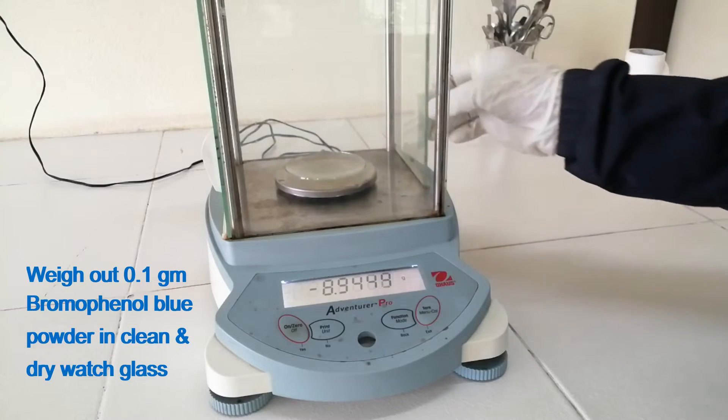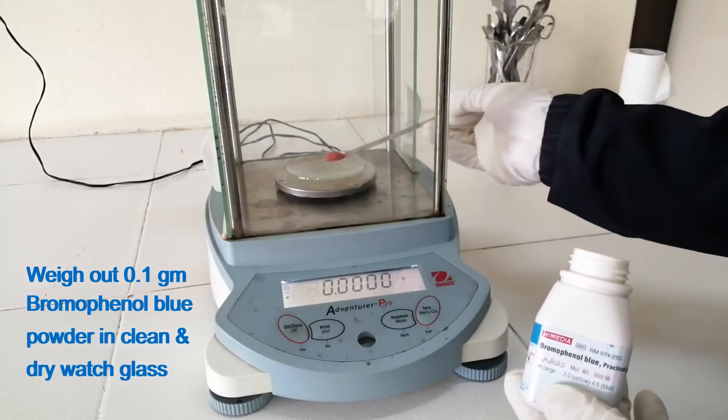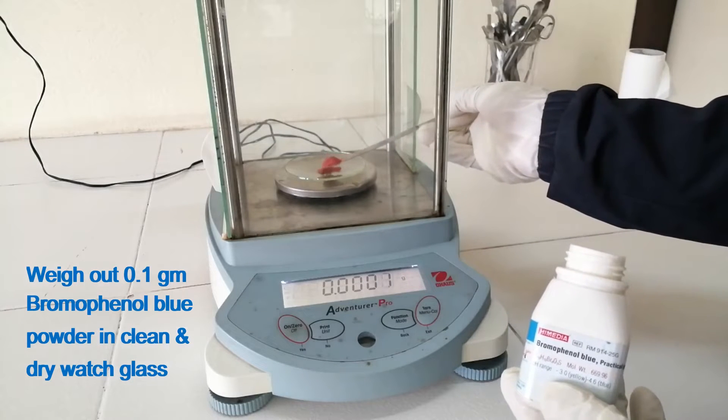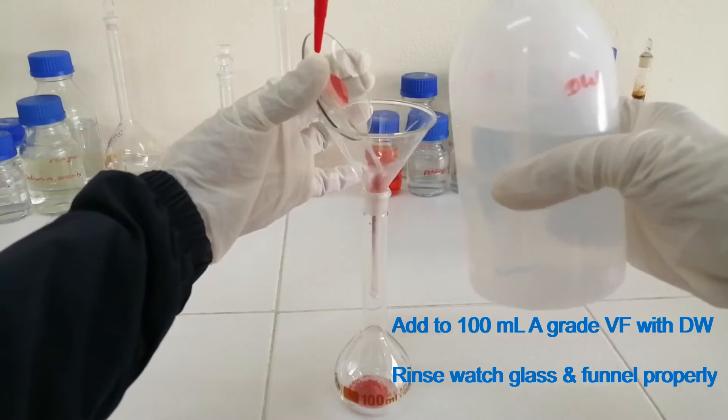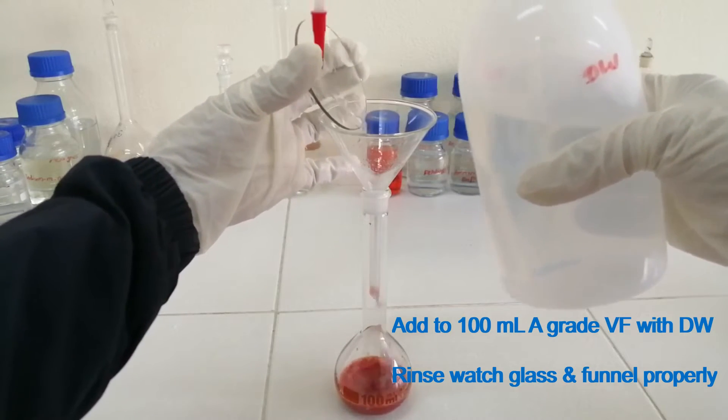Weigh out 0.1 gram bromophenol blue powder in a clean and dry wash glass. Add to a 100 ml A-grade volumetric flask with distilled water. Rinse the wash glass and funnel properly.